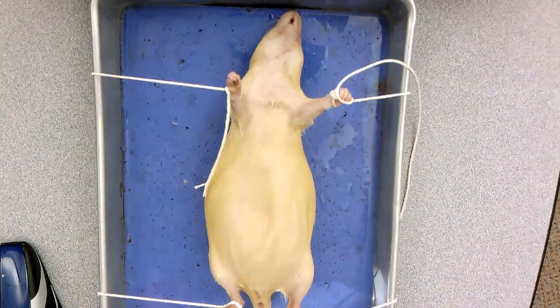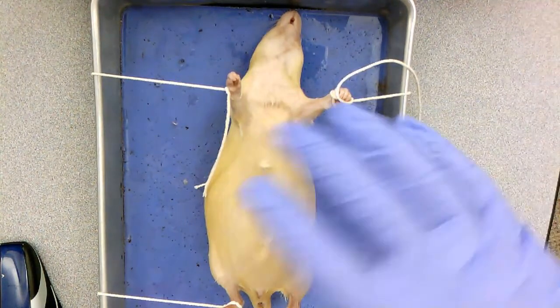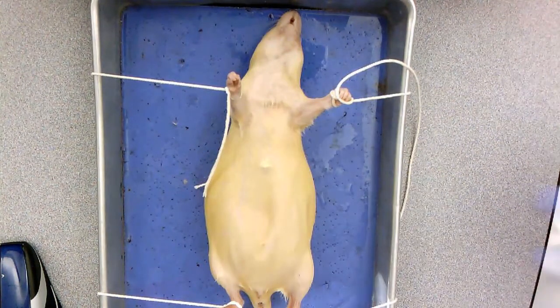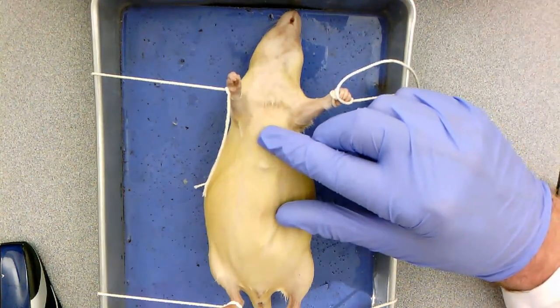All right, so this is the rat that we have here, and you can see I already have the rat tied down. That's the first thing you want to do: get some twine and tie that rat down. We're going to open up the ventral body cavity. We learned in class you have the ventral body cavity and the dorsal body cavity. We're going to open up the ventral body cavity, but we don't want to make a very deep incision here. We're just going to remove the skin from the ventral body cavity.